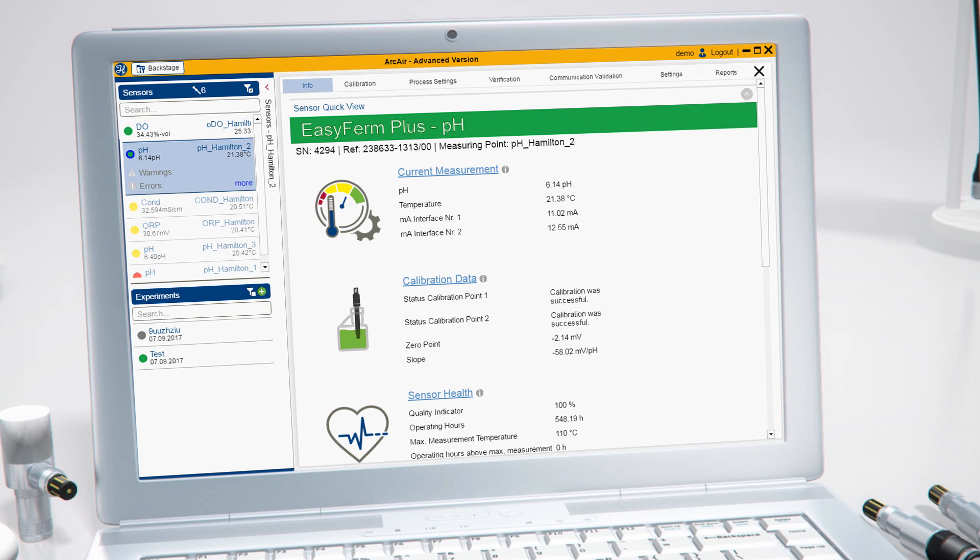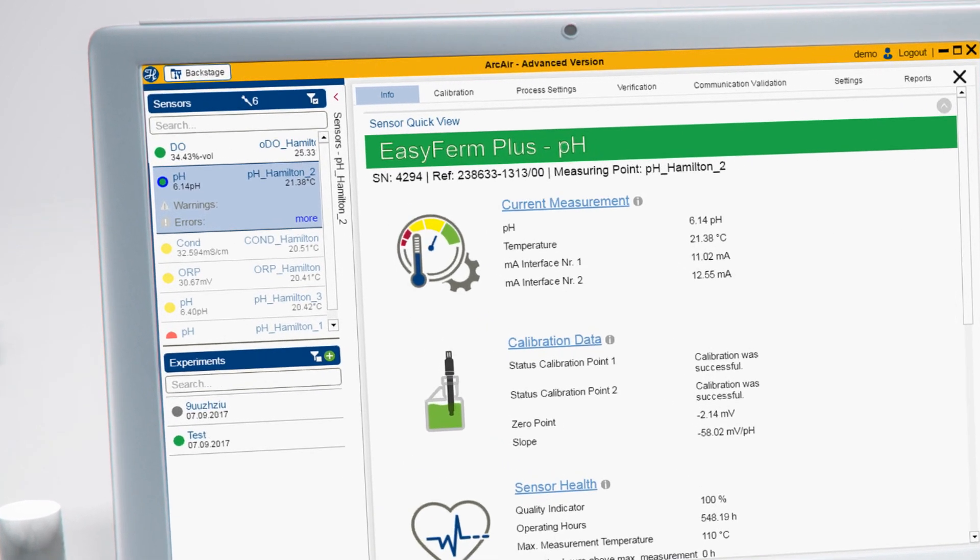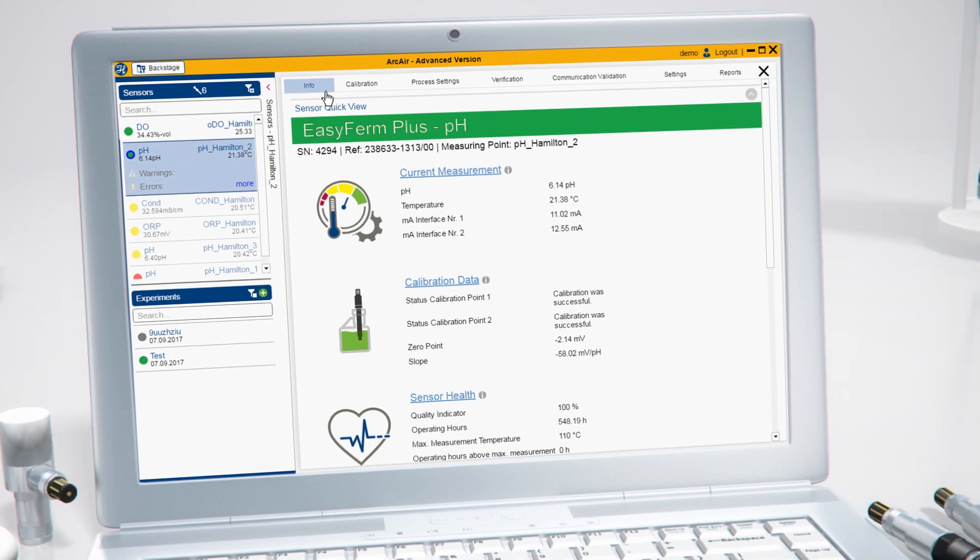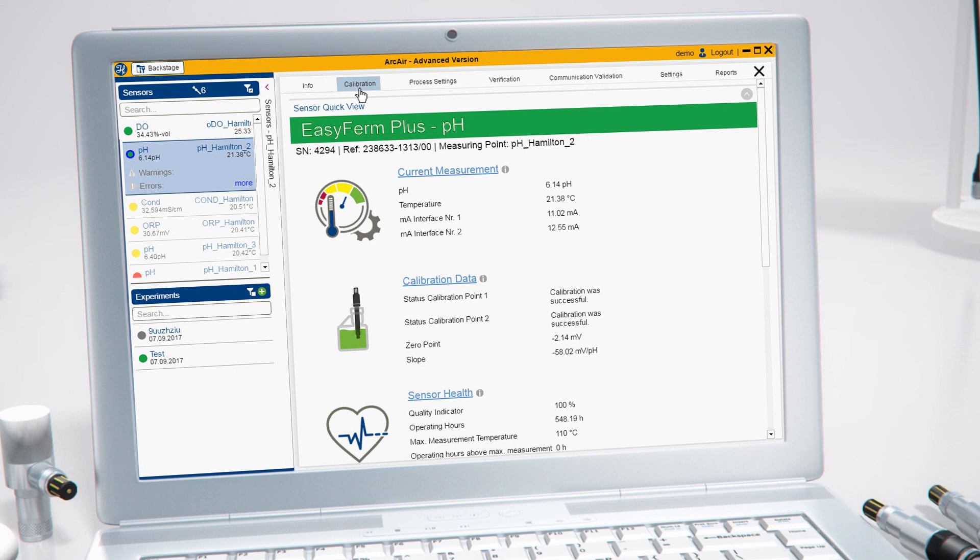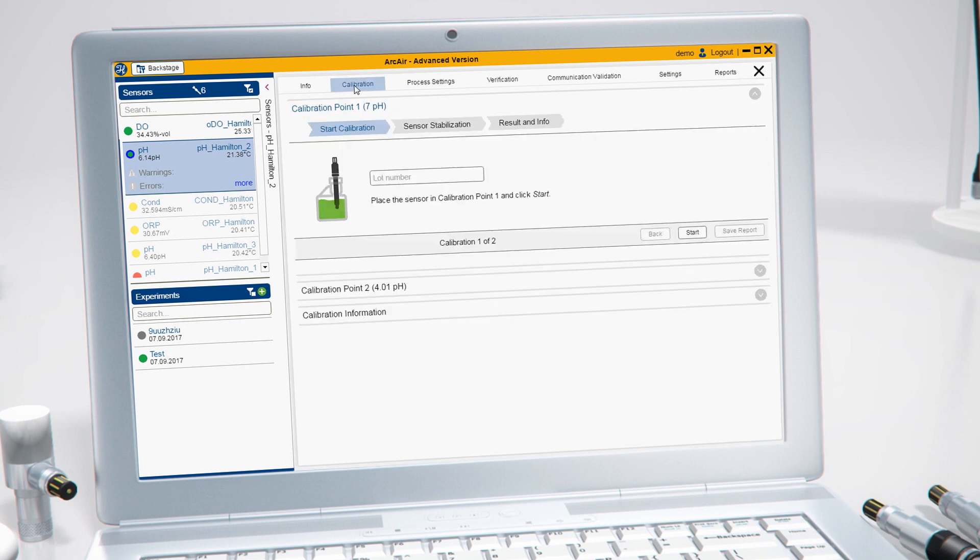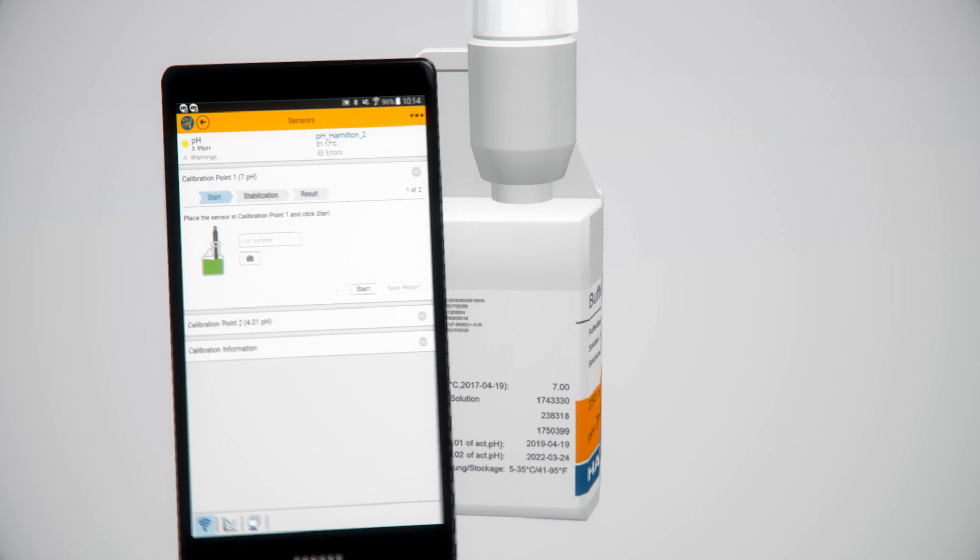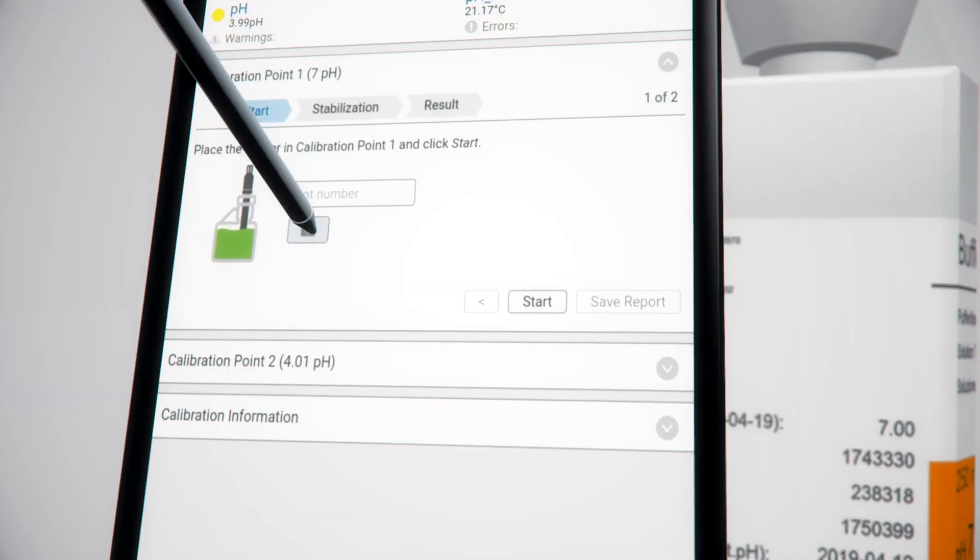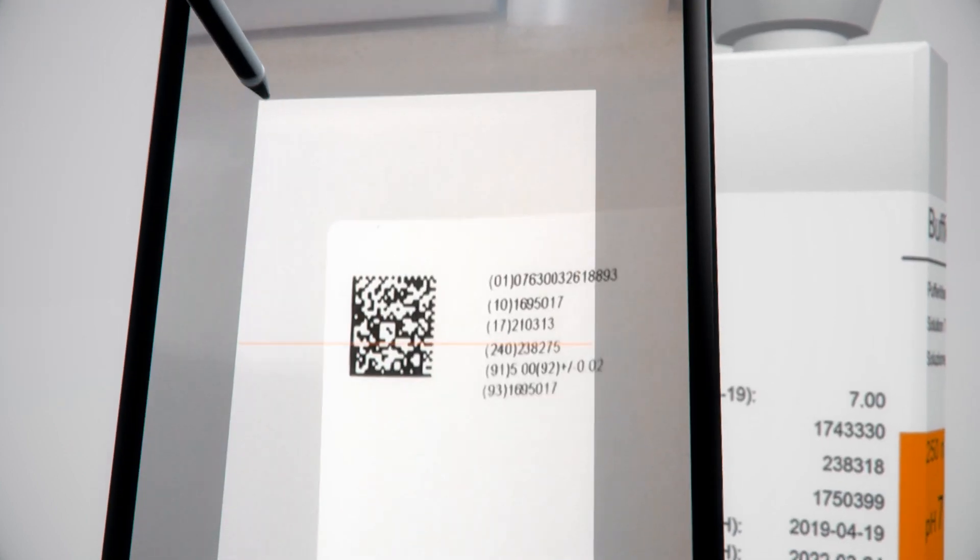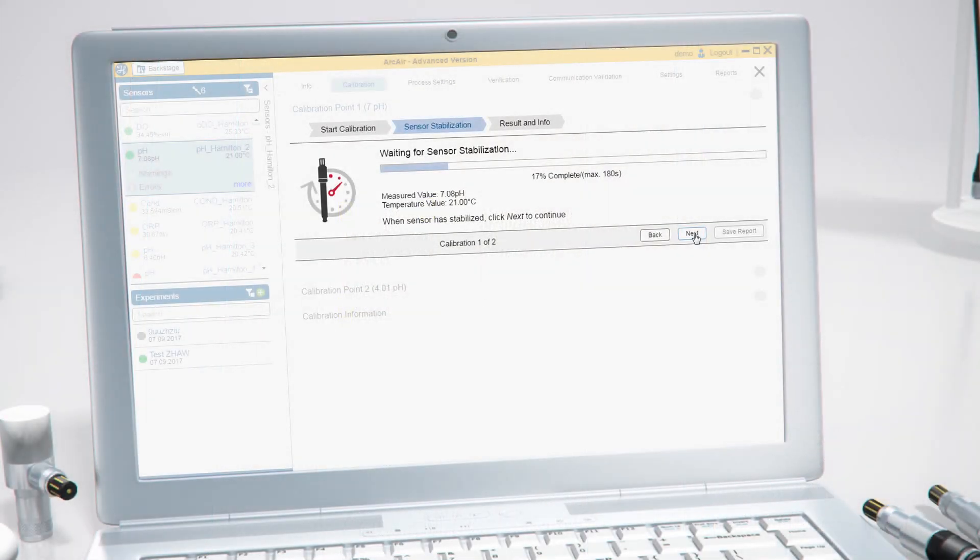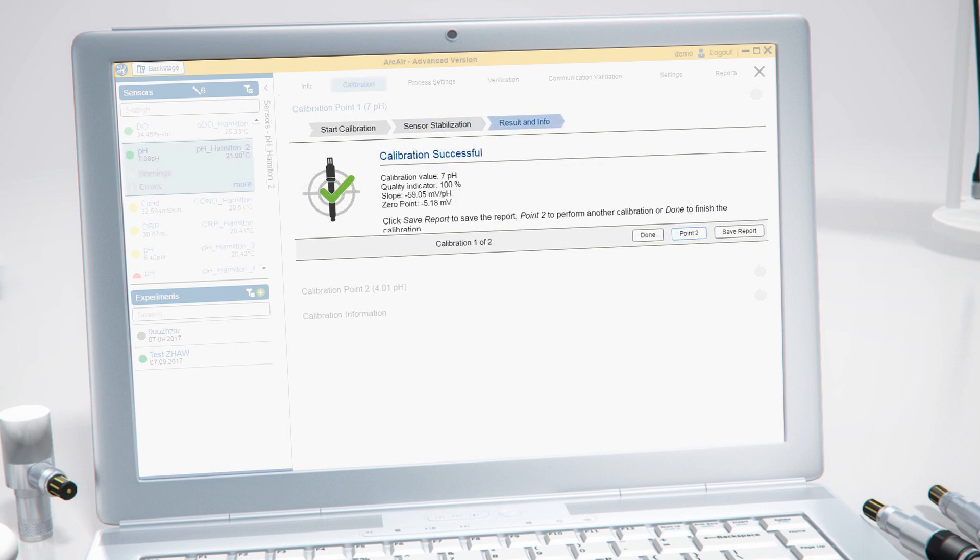Select the sensor that you need to calibrate from the list. Go to calibration and enter the lot number of the calibration buffer or scan it with your mobile device. Click start and follow the instructions on the screen.